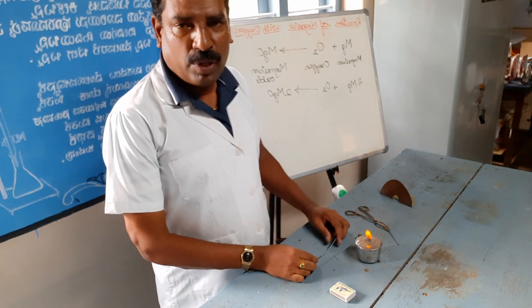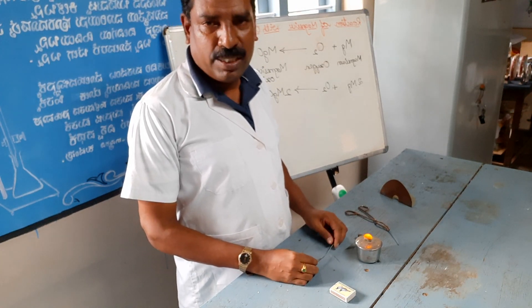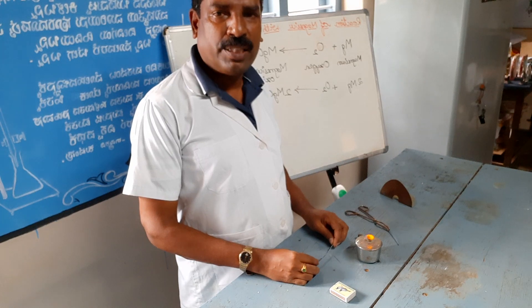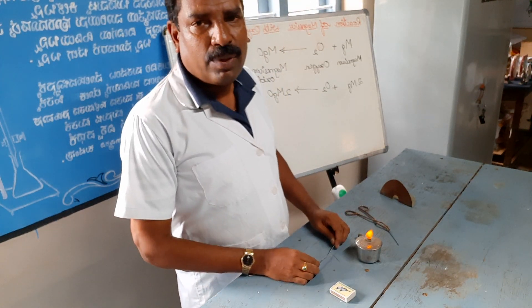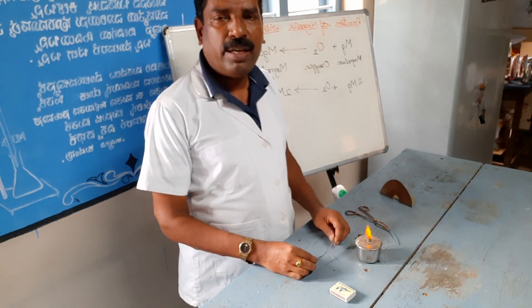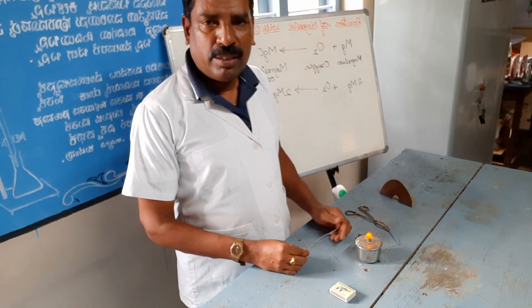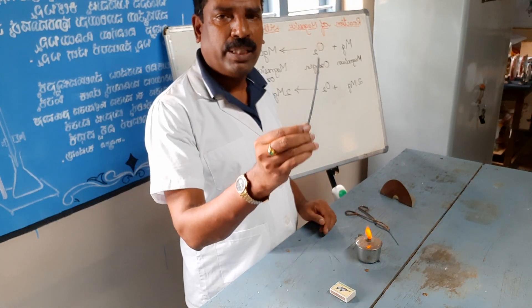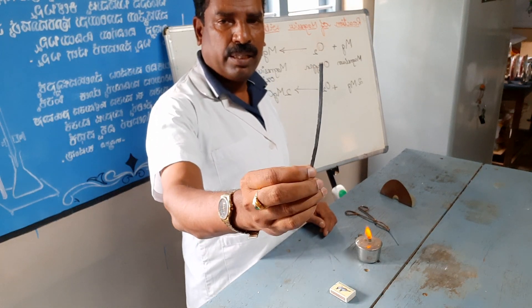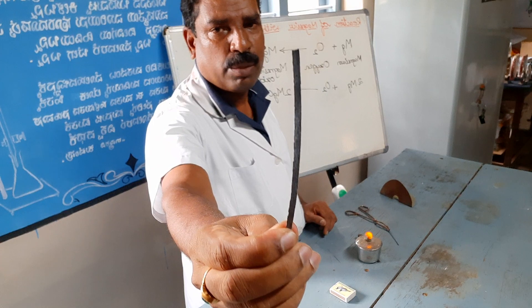I am going to show an experiment of reaction of magnesium with oxygen. Magnesium is one of the moderately reactive metals. While storing, it reacts with oxygen to form an oxide layer. This layer prevents the further oxidation of the magnesium ribbon.